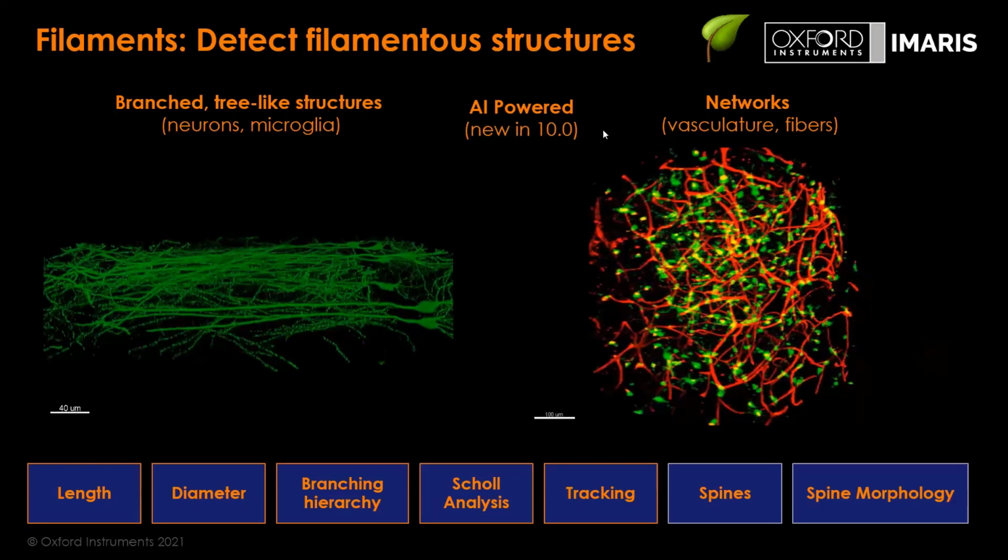There's one question. How large are the data files for transferring spots and surface images from one computer to another? Are dedicated USBs required to do so? It depends on your own data, how large it is, because we typically save the whole data plus the spots on it. It is possible to just export spot data. You can export it in the very simplest way as an Excel sheet. So then it's literally no space at all. So you can have the coordinates of where things are located in space and all the statistics in the Excel sheet.